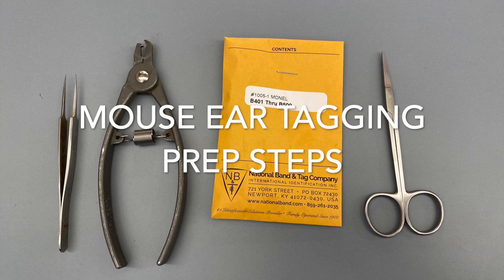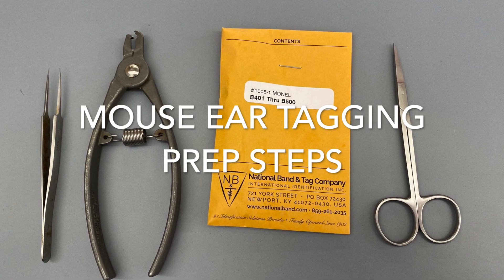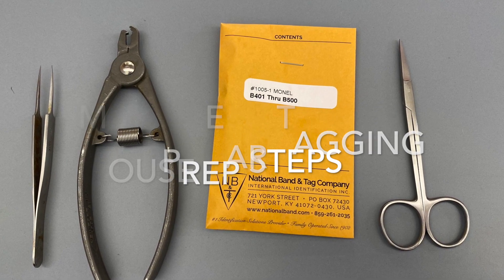In this video, I'll show you the best steps to take in order to prepare to tag mice in the ear for identification purposes.